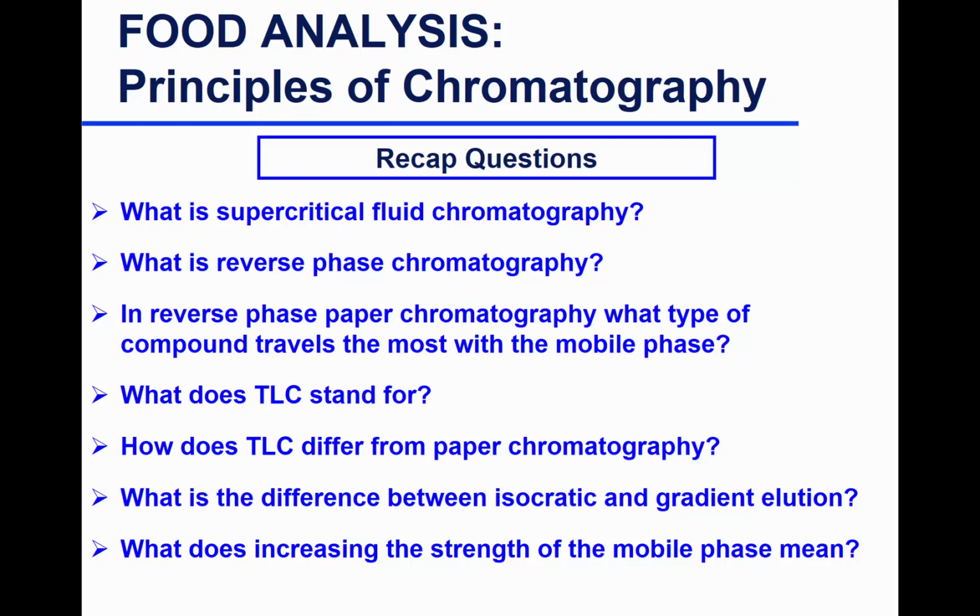Thin layer chromatography. Incorrect. What does TLC stand for? Fair enough. Okay. How does TLC differ from paper chromatography? How does it differ? Oh, Alex, go ahead. Exactly. So particle size in thin layer chromatography is more uniform and smaller. So we get more consistency from one run to the other, and we get better separation.